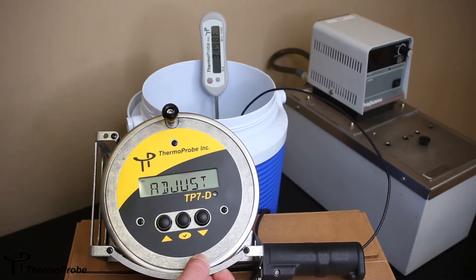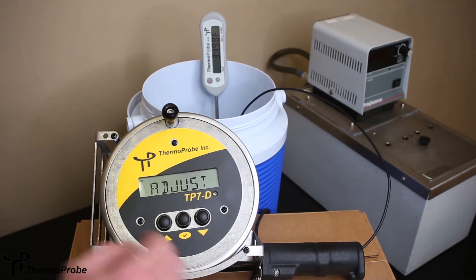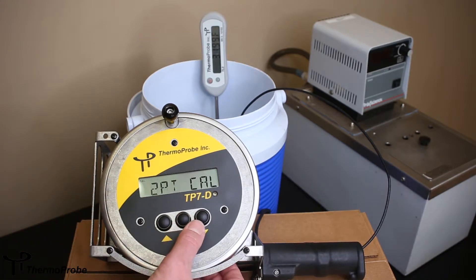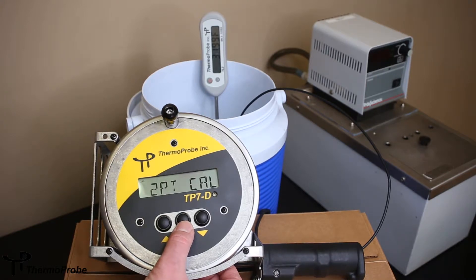Now I can decide if I want to make an adjustment, which I do. You can also see that I have a calibration icon. You can do a two-point, a three-point, or a four-point calibration. We're going to be doing a two-point. It's recommended that you do the points in incremental order — do the freezing point first and then your higher temperature second.